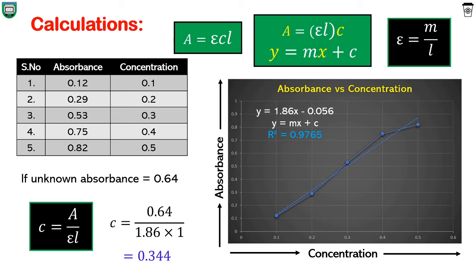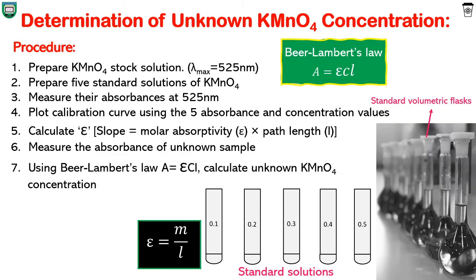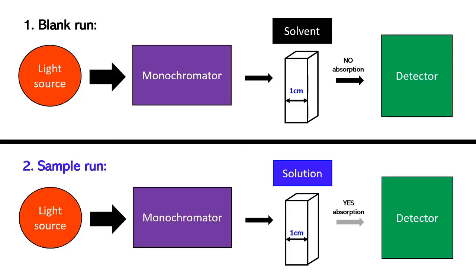In the same way, measure the absorbance of the 5 standard solutions and note them in the lab book against their concentrations, as shown at the top left. To run the first solution, rinse the cuvette and fill it with the solution. Before placing it in the cuvette holder, wipe the outer surface of the cuvette with a Kimwipe. Then run the experiment to measure its absorbance and note down the absorbance value from the computer screen. Similarly, collect the data for all 5 standard solutions.